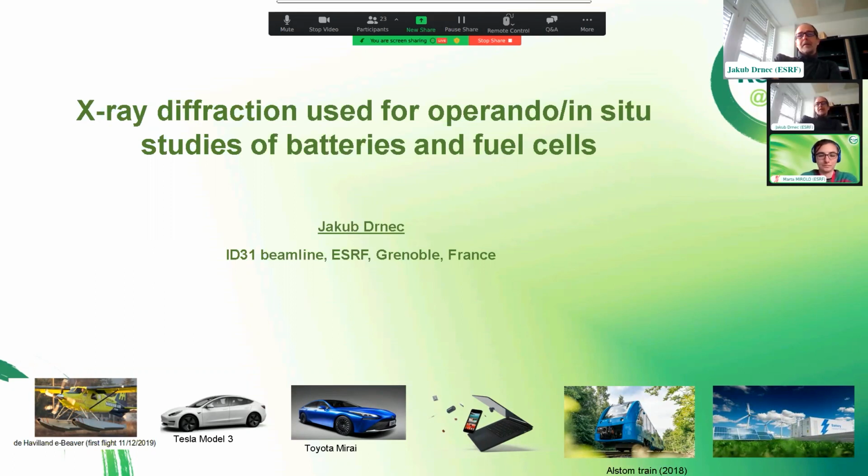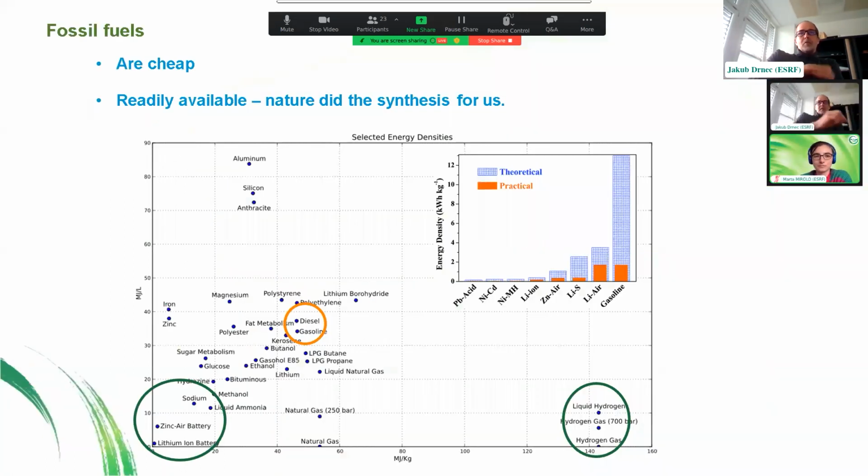But everything which I will show you here will be very useful if you're planning to measure anything at ESRF using high energy X-rays and using diffraction or small angle scattering, or maybe some other more complicated techniques which I will show as well, such as diffraction microscopy or diffraction tomography. So let me move on here.